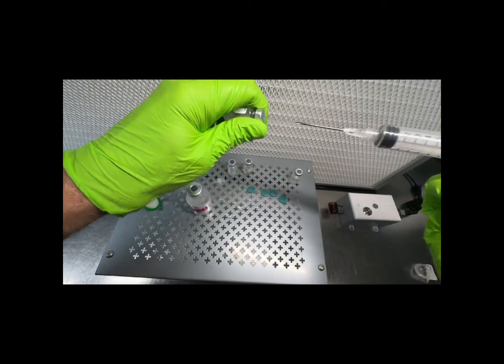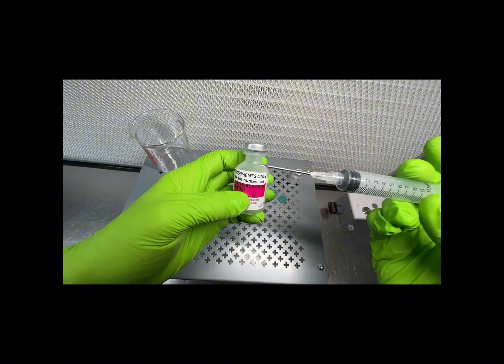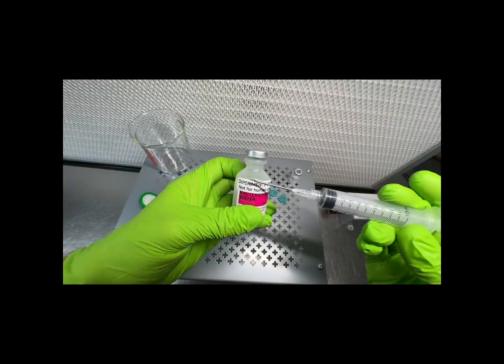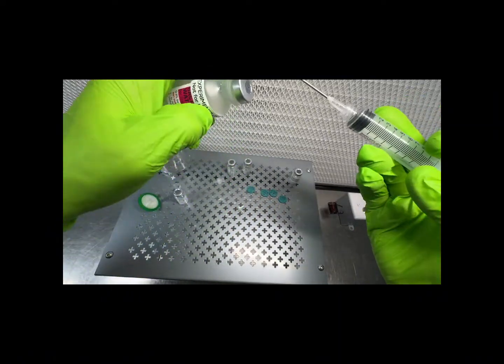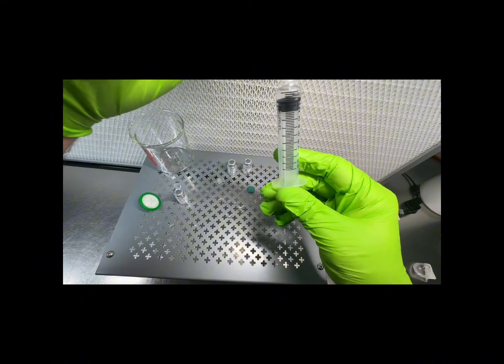Okay. Because I used such a big needle and had a little drip, I'm gonna go back in. Normally I would not stick this dirty needle that's been in those vials back in this bacteriostatic water vial, but I've got it clearly labeled for experiments only, so I'm not too concerned about it. I want to go in and get my last full milliliter here.